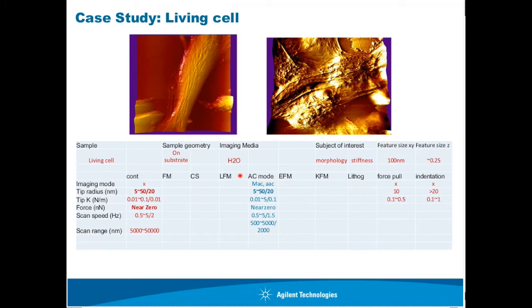Next question. Hello, I use contact mode for analyzing electroless nickel-plated substrates, which have small grain boundary-like structures. At times, the scans don't show any pattern. How can I increase the sensitivity of the images? Analyzing electroless nickel-plated substrate is probably very similar to, which I haven't covered this time, an electrochemical plating sample, which is a large electrode with tiny little crystals on the surface.